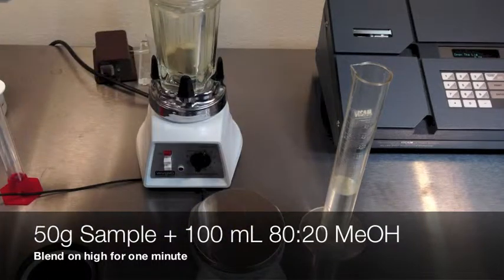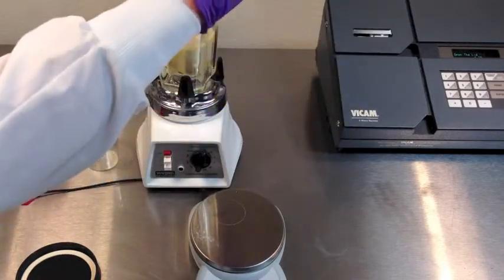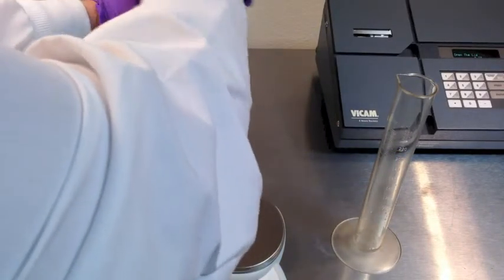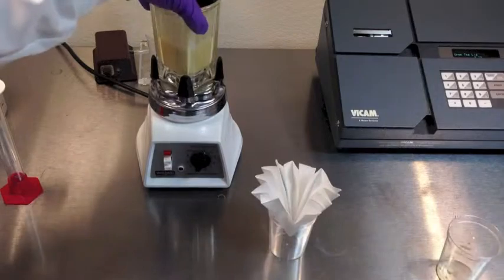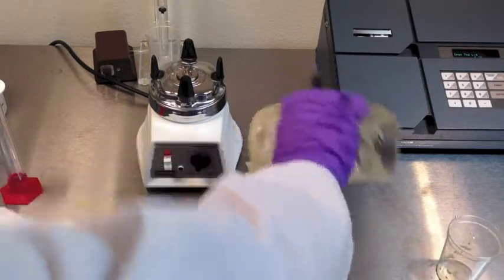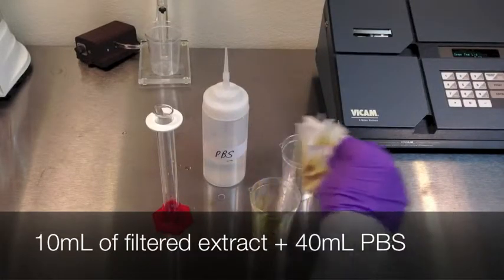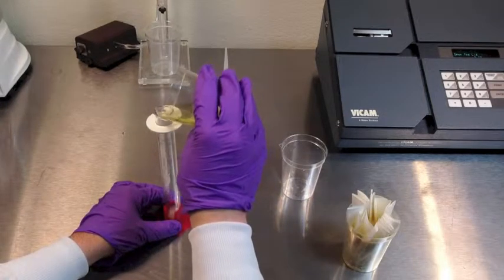Combine 50 grams of sample with 100 milliliters of 80-20 methanol. Note: for this test, no salt is required. Blend for 1 minute. Pour the mixture into a fluted filter paper and collect into a clean vessel.